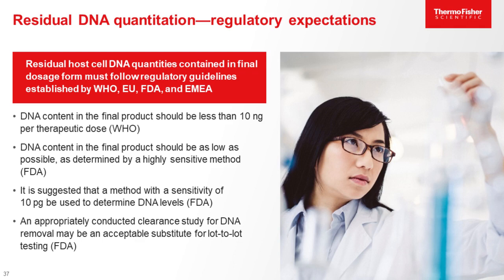Thank you, Chantelle. Yeah, so in a classical adeno-associated virus production workflow, viral vector production depends on the availability of high-quality plasmids. However, these plasmids are not allowed in the final product and thus need to be removed. This creates the need of a sensitive and robust method to measure residual plasmid levels. In the downstream process, AAV are purified. Here is when a residual host cell DNA and plasmid DNA quantitation is required.